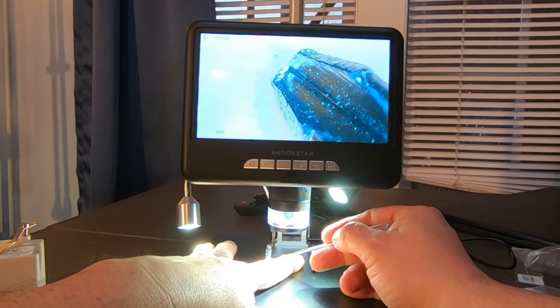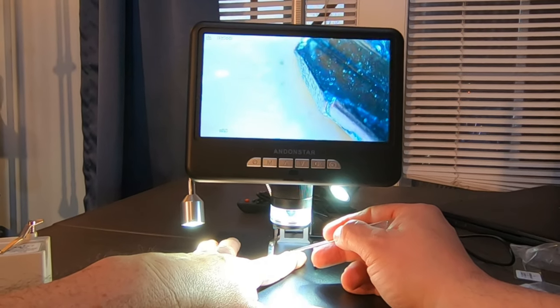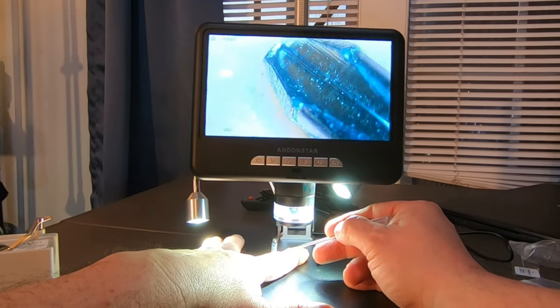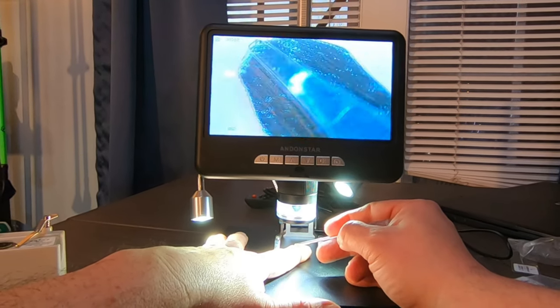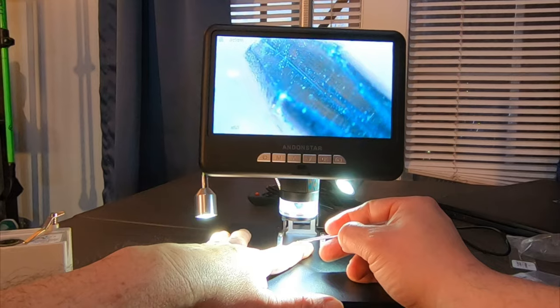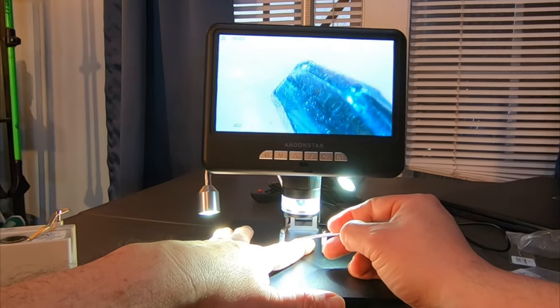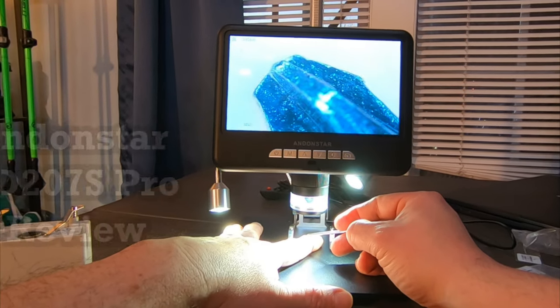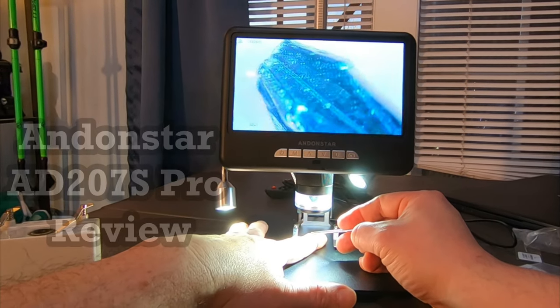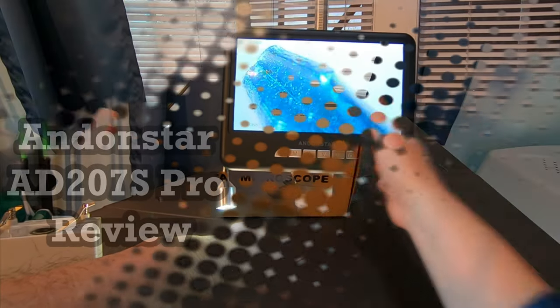That is a trip. Look at that. Oh my gosh. You can really see up close with that part of the screwdriver.